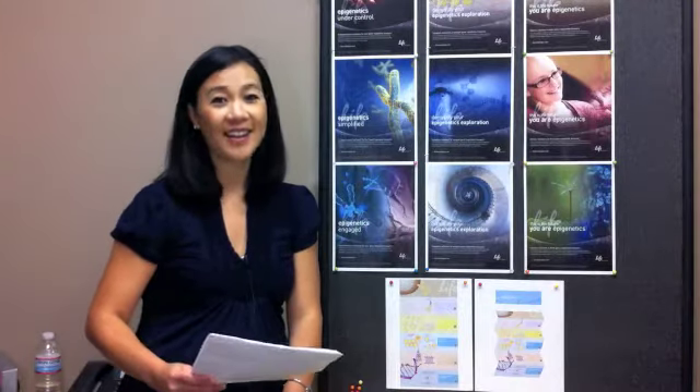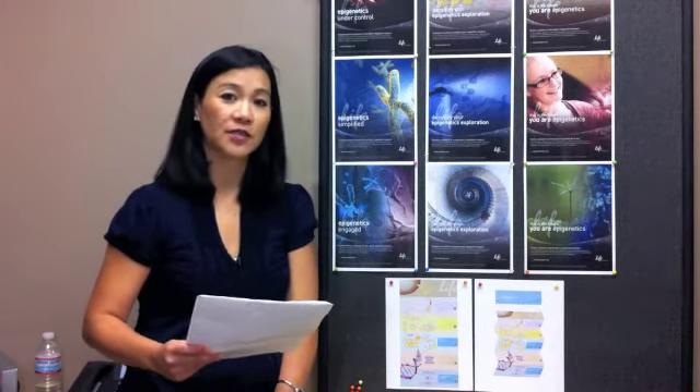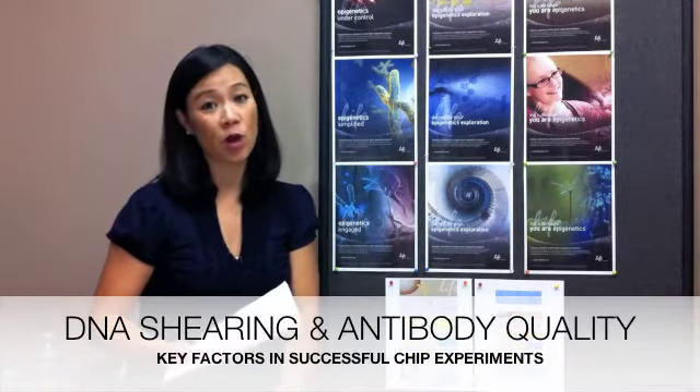We hear this one a lot, and unfortunately there's no short answer. ChIP can be affected by a number of factors. That being said, two of the most important factors in a successful ChIP are DNA shearing and antibody quality.